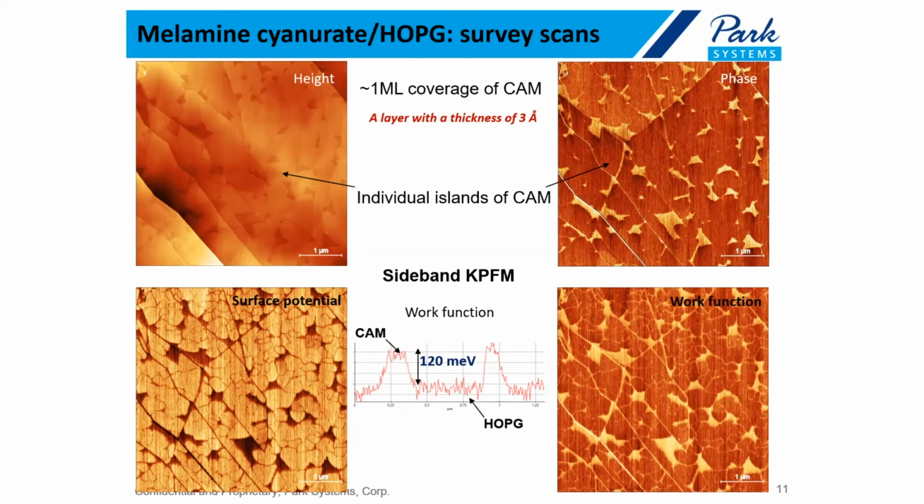And that was quite an exciting result, because previously KPFM and high resolution KPFM was exclusively limited to ultra high vacuum, and that kind of measurement was thought to be impossible in ambient, because people thought, well, because you apply voltage to the tip, it may damage your delicate layers. And those layers are indeed very delicate.